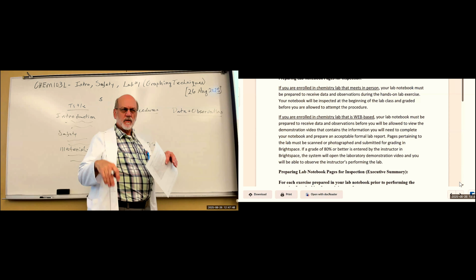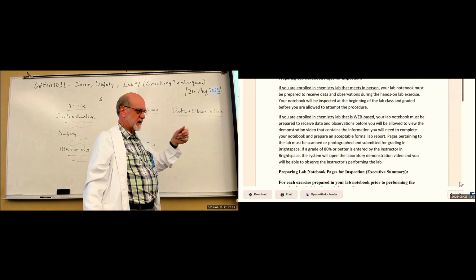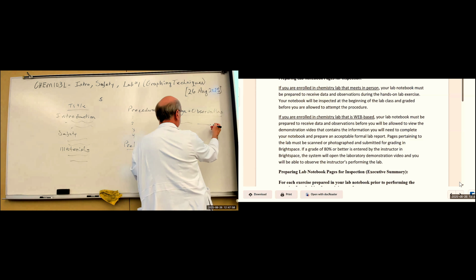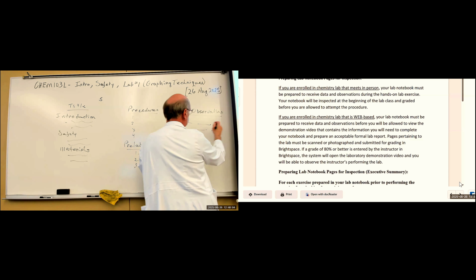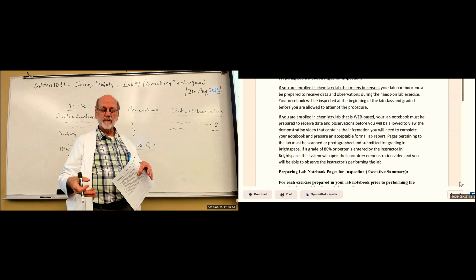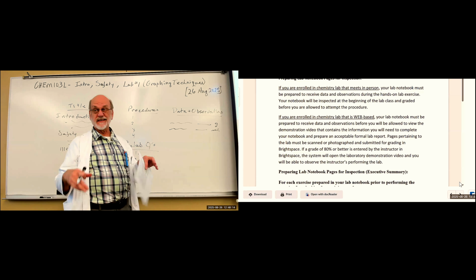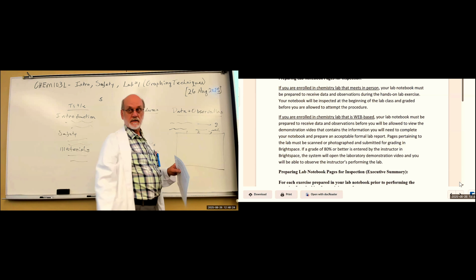If it's a very simple experiment where you're going to do this and measure that, measure that, measure that, and only have one value for each one, then you can have a list here of what that is, and then something here and the units of measure, and then something here, maybe milliliters here. You can do it that way. If you're going to have an experiment that has lots of data to be collected and it's organized, the best way to organize it is in a table. So you would set up a table and say you're going to repeat this experiment 3 times. Call them reps. Right?